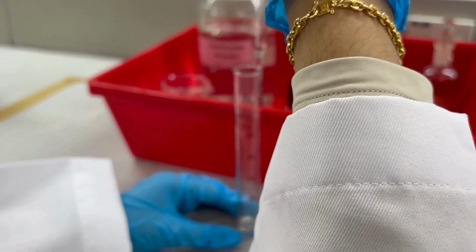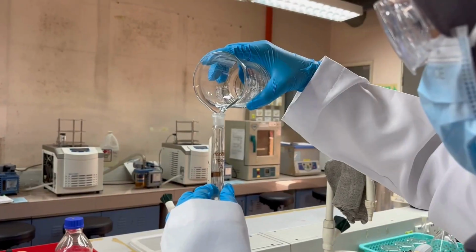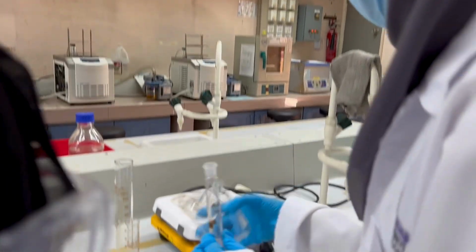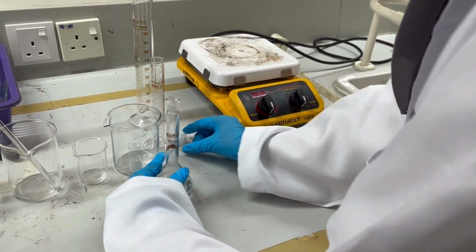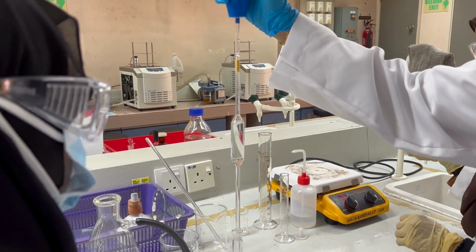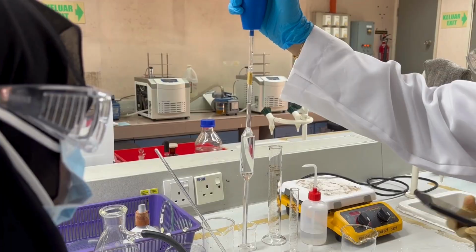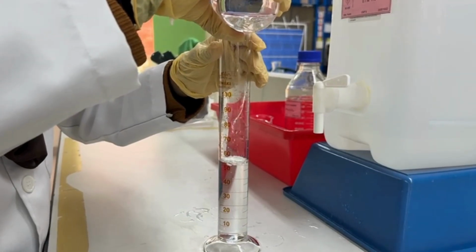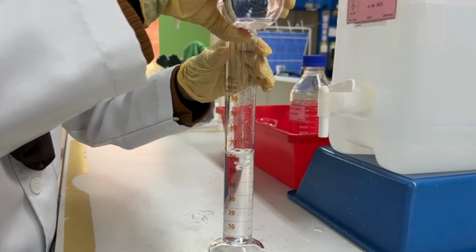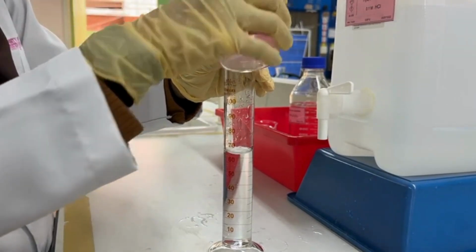Measure 12 ml of 3 mol hydrochloric acid and then transfer it into a 100 ml volumetric flask. Transfer 25 ml of amine solution by using a pipette into 3 different beakers. Measure 75 ml of 0.1 mol hydrochloric acid and pour it into the beaker containing amine solution to dilute it.